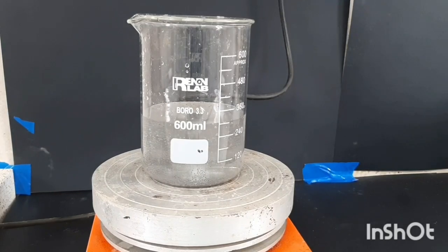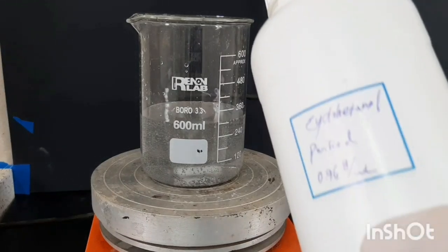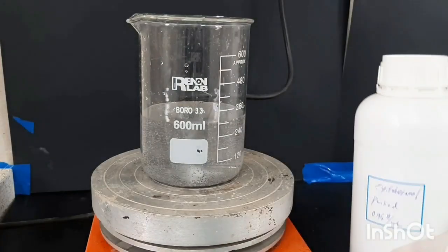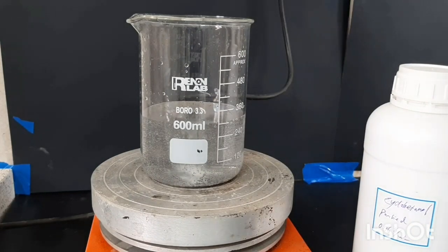After a while, most of the tungsten has dissolved in the hydrogen peroxide, but it doesn't matter that all of it dissolved. We can add the cyclohexanol and continue with the heating, and the remaining tungsten will react and dissolve in the hydrogen peroxide then.